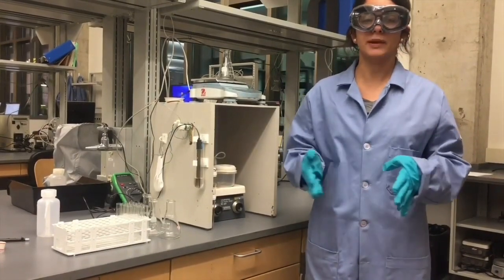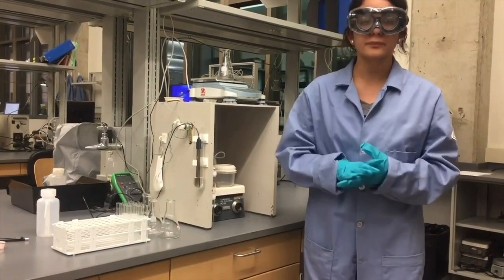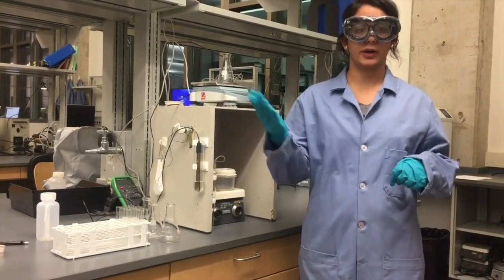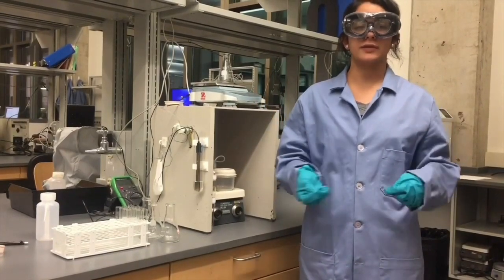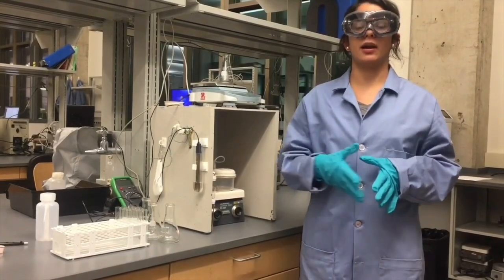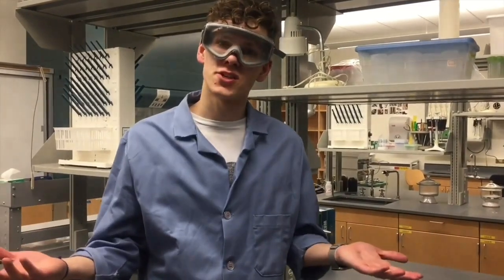Otherwise, the ICP won't be able to read them properly, and then we won't get the results that we're looking for. We must create a set of progressive dilutions in order to build a working curve, keeping in mind the effective working range of the instrument, which is about 4 times the detection limit all the way up to the linear range. Where do you find this information?